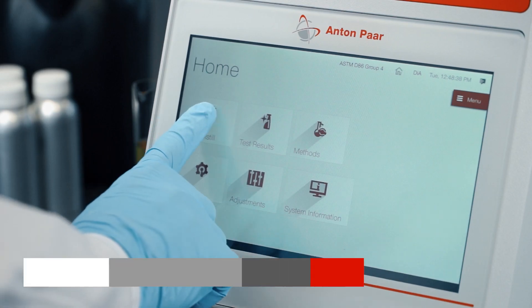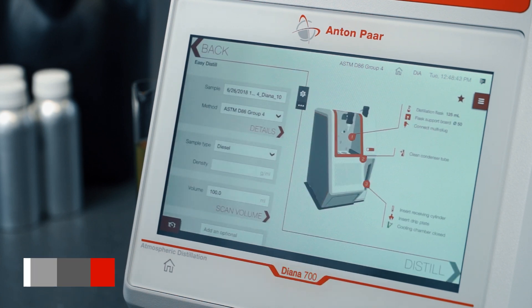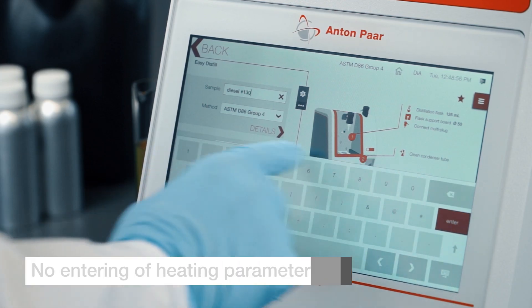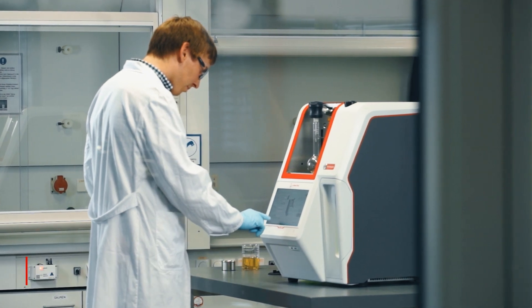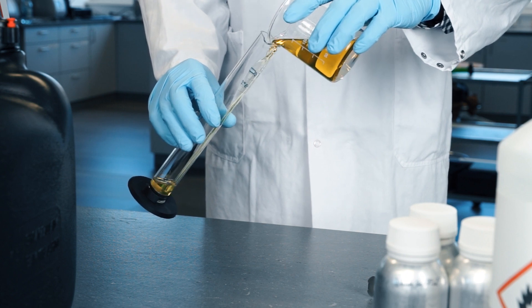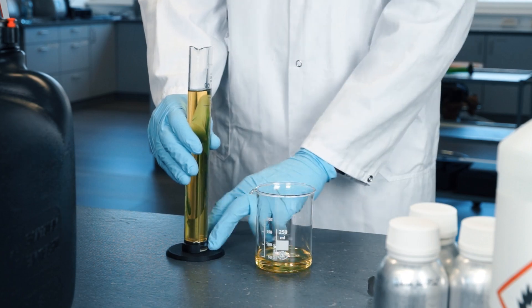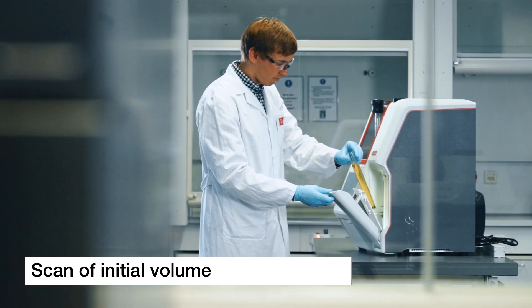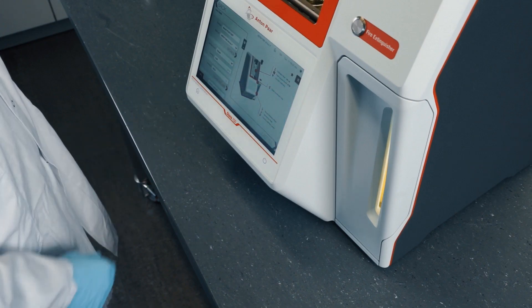The intelligent condition monitoring system guides the user through the measurement setup to provide maximum support and facilitate error-free operation. After entering the sample name and choosing the method, the instrument is ready to start the distillation. Once your sample is prepared, the volume detection of the receiving chamber makes use of the high accuracy of contact imaging sensor technologies. The sample charge volume is measured by the instrument before the test starts and corrected to 100% volume if necessary.